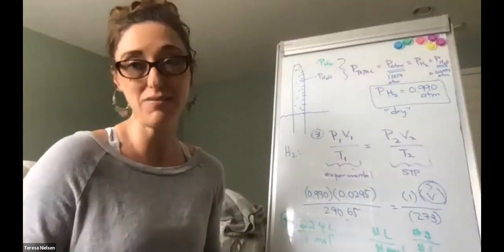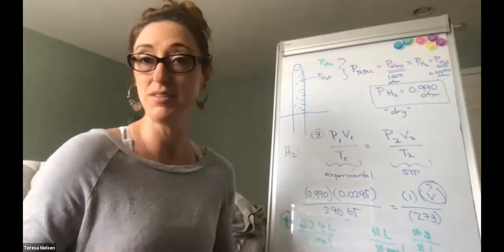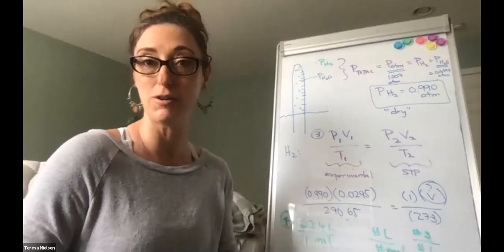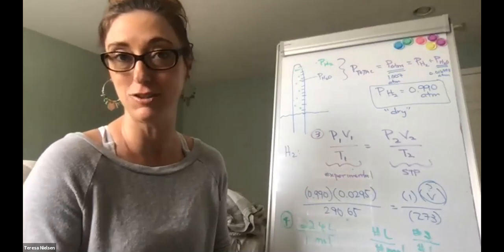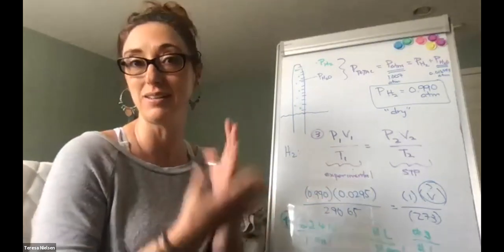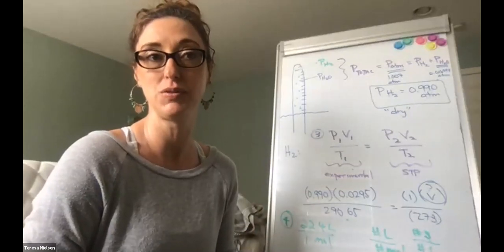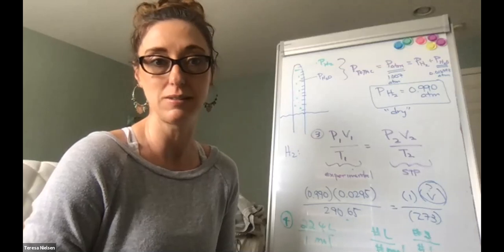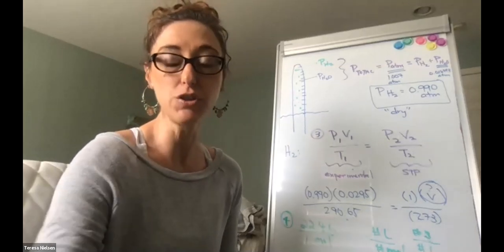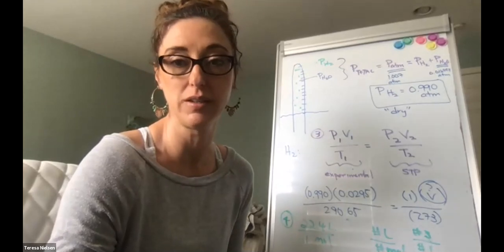So I love this lab. I wish we could have done it together, but I love this lab so much that I do it in varsity chemistry and in JV chemistry because it's so good. You can get great experimental results right in our lab to prove Avogadro's hypothesis, okay? So you should get very, very small, less than 1% error. It's a really good lab.